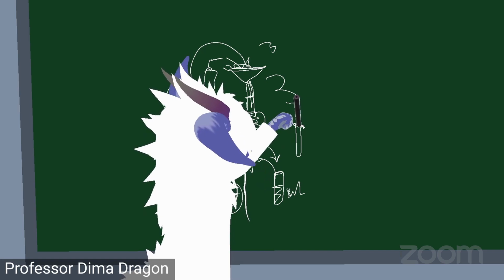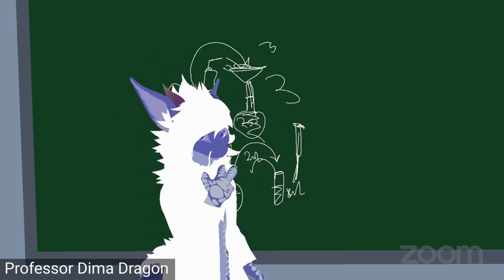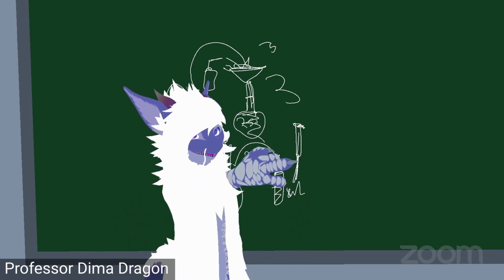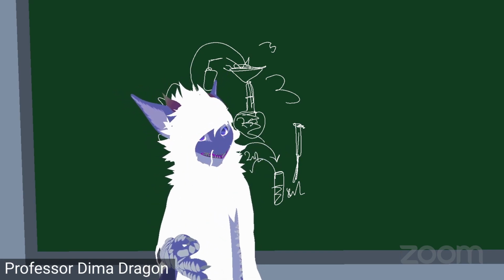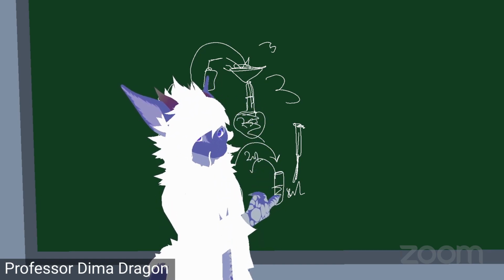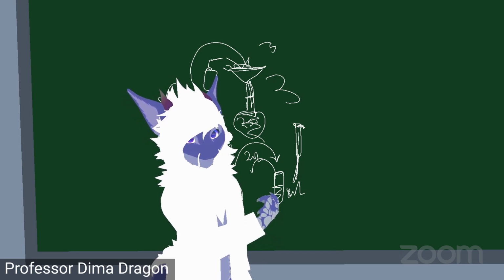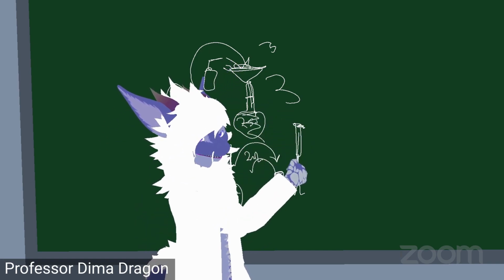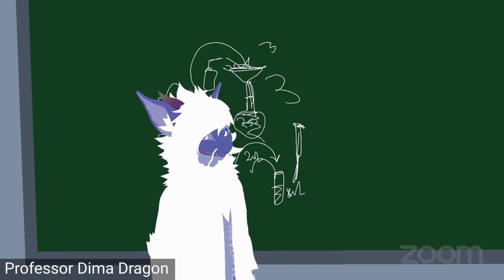You guys have disposable tips and stuff too. You guys have used these before. If you need help, depress it first slightly. Don't go to the last click. You'll go to the last click on the second try. So pull it down, and go into the solution. Lightly lift up, and then when you carry it, put it in there. Push, then push finally. Then eject it into the trash.